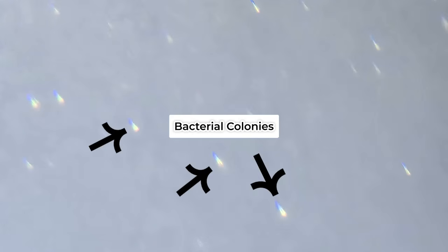So after a couple of days, I have noticed a successful CRISPR experiment reaction, and I witnessed whitish bacteria growing on the plate as seen here.